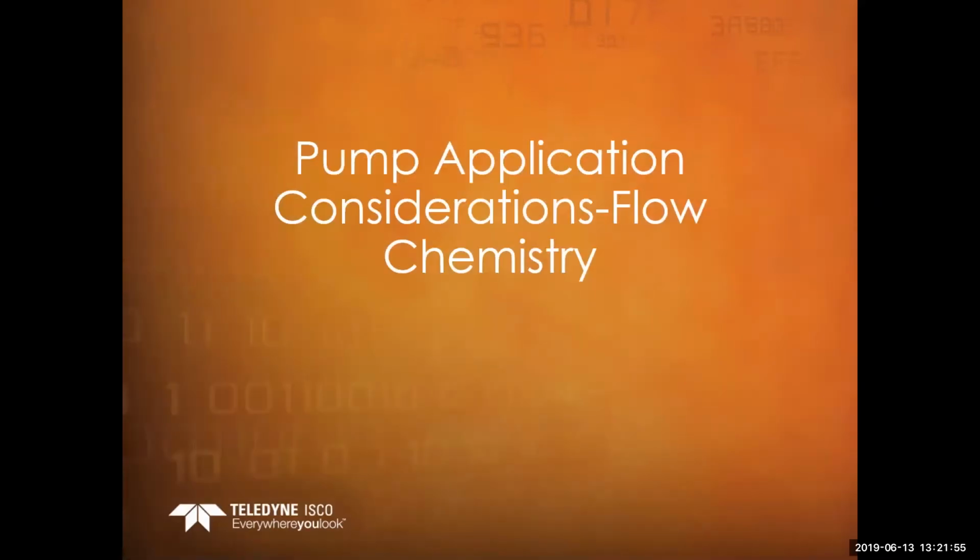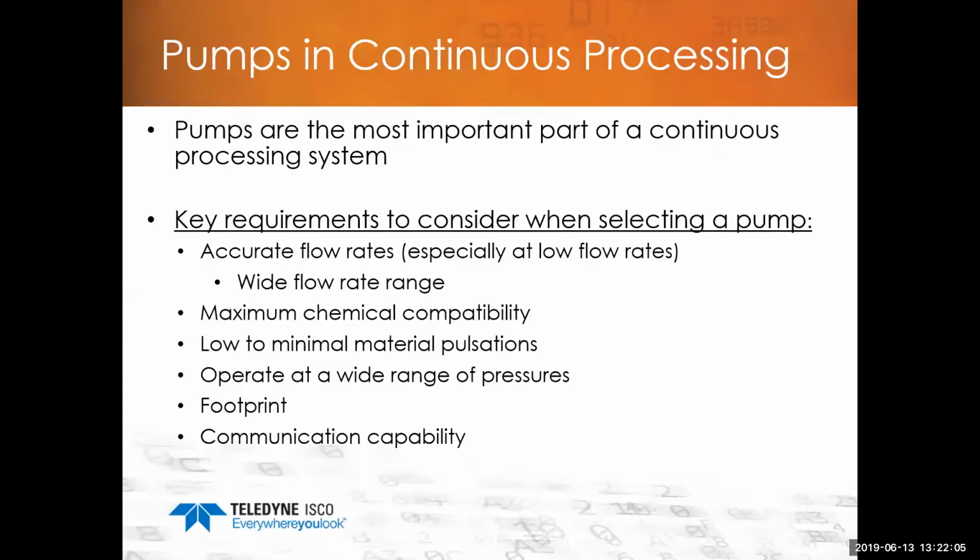As we think about these questions here, there will be others that we want to consider, but those are some you want to look at as you're going forward. Let's get into the application considerations for flow chemistry.